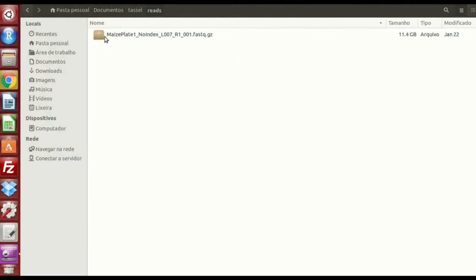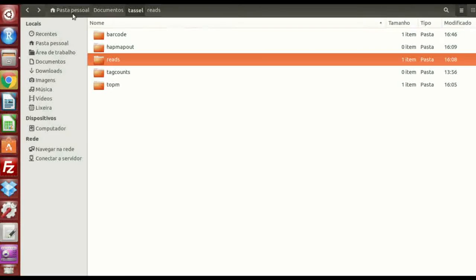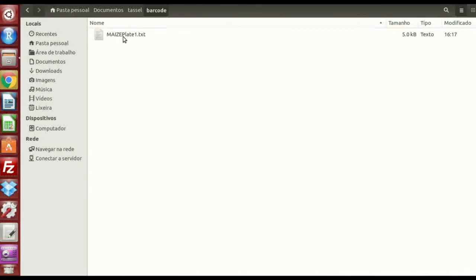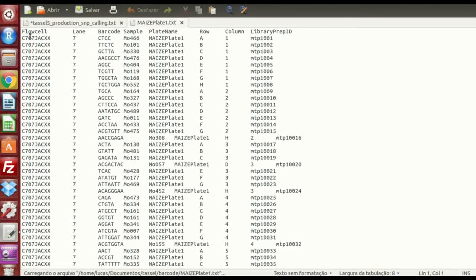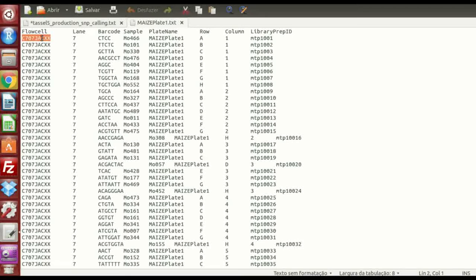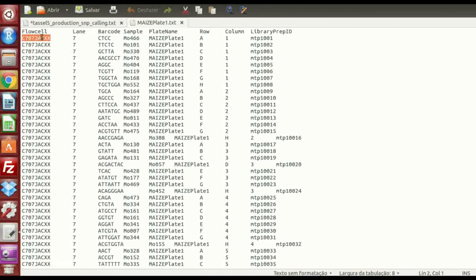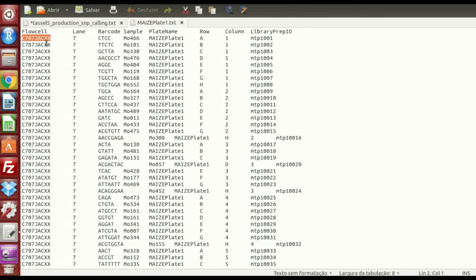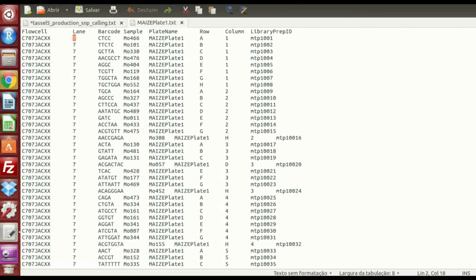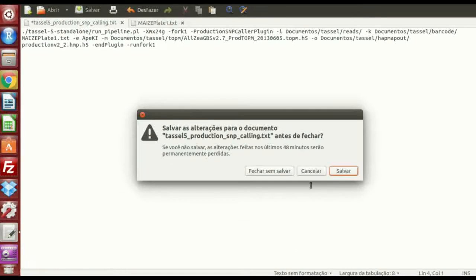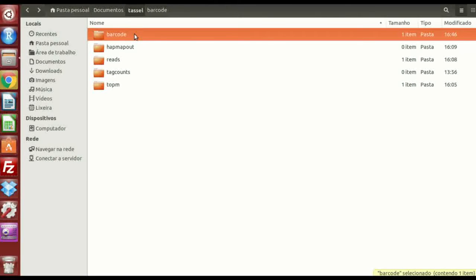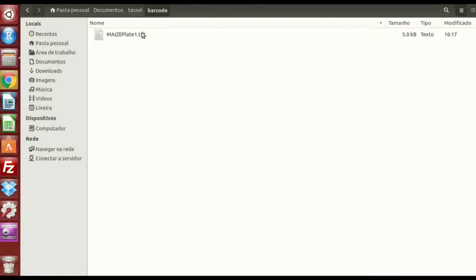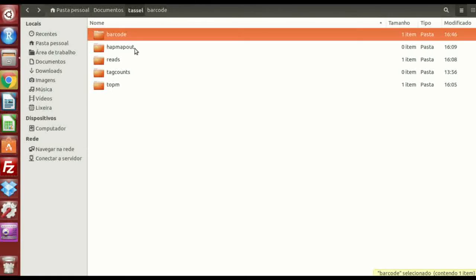And go back to the barcode file, you're gonna open that. So in the flow cell, you're gonna put the same flow cell for each individual, and the same for the lane number. Okay. Let's see. So I think this is what's important for the barcode file.